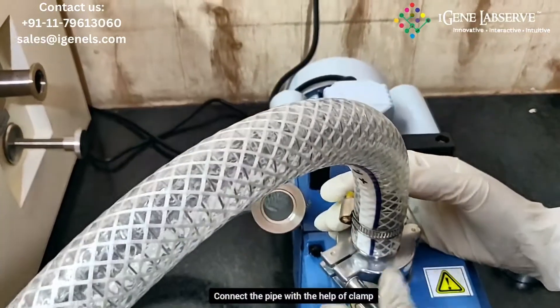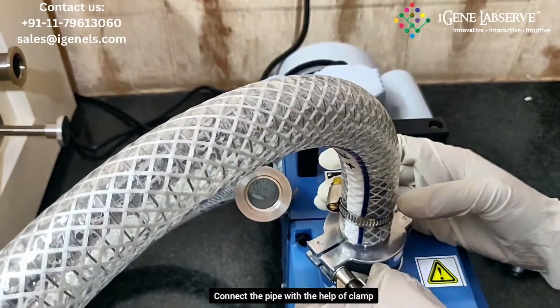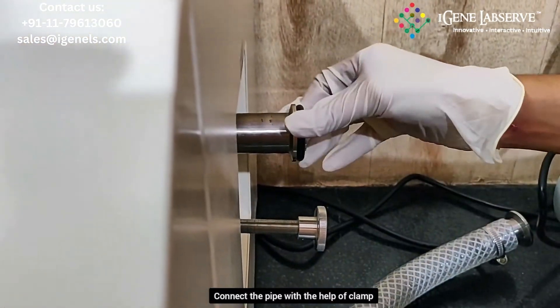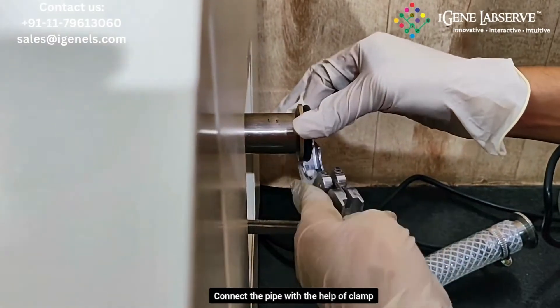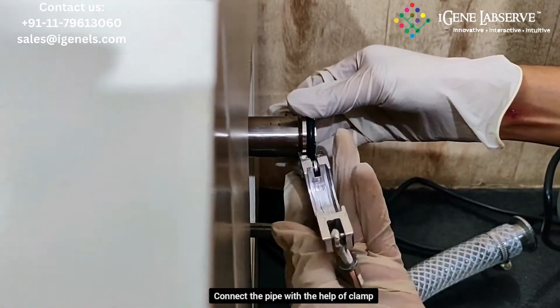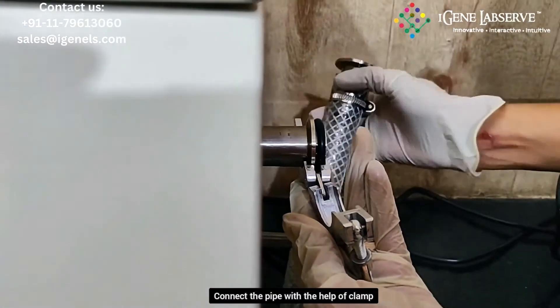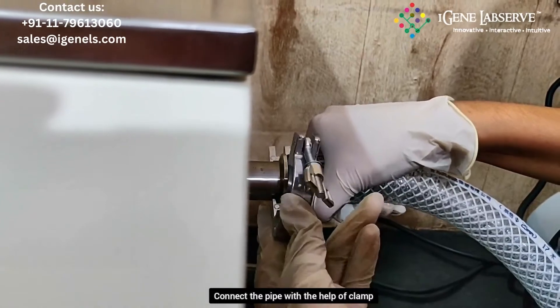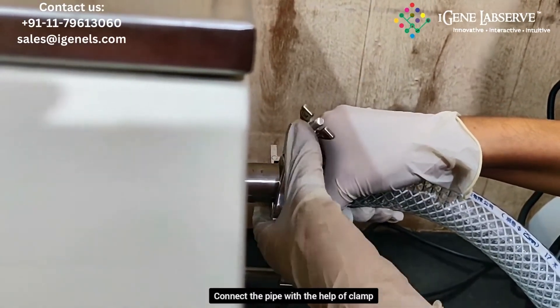Here you have to connect the pipe using these clamps. You have to tighten it. Tape this o-ring and place it over here like this, and place this clamp over here. Then take the pipe, place it like this, and tighten the clamp.